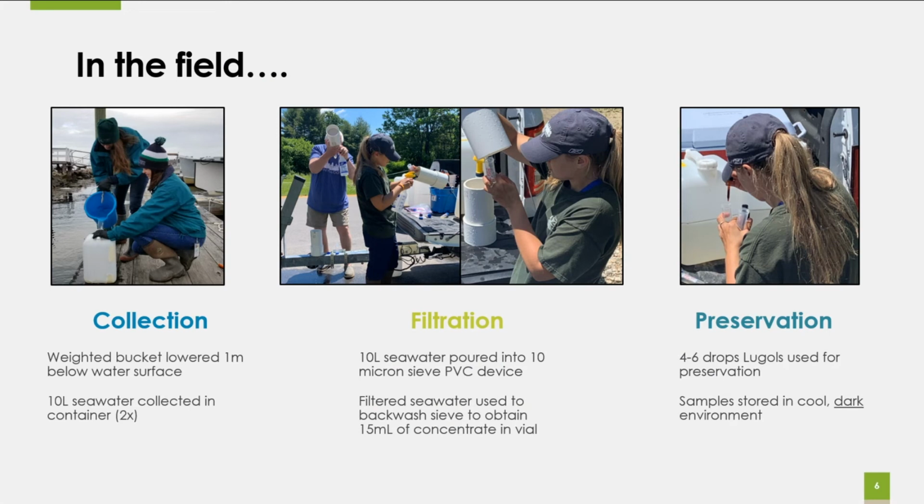Let's see, field collection. I realize I'm in most of these pictures, not by choice, just these were the best pictures we had to show what we do in the field. Basic collection, and I can show you, we have all the sampling supplies here, and I can show you a walkthrough of how we sample if you want to, but this is something I don't think you'll ever need to do. It's just good for you to have some background information on what you're looking at under the microscope and where it's coming from.